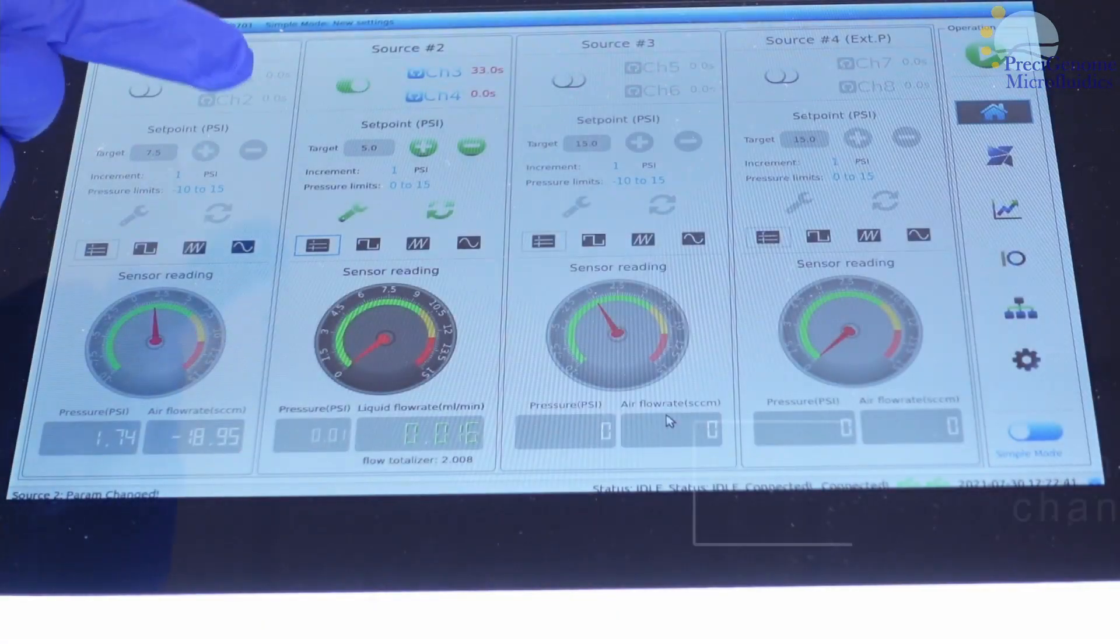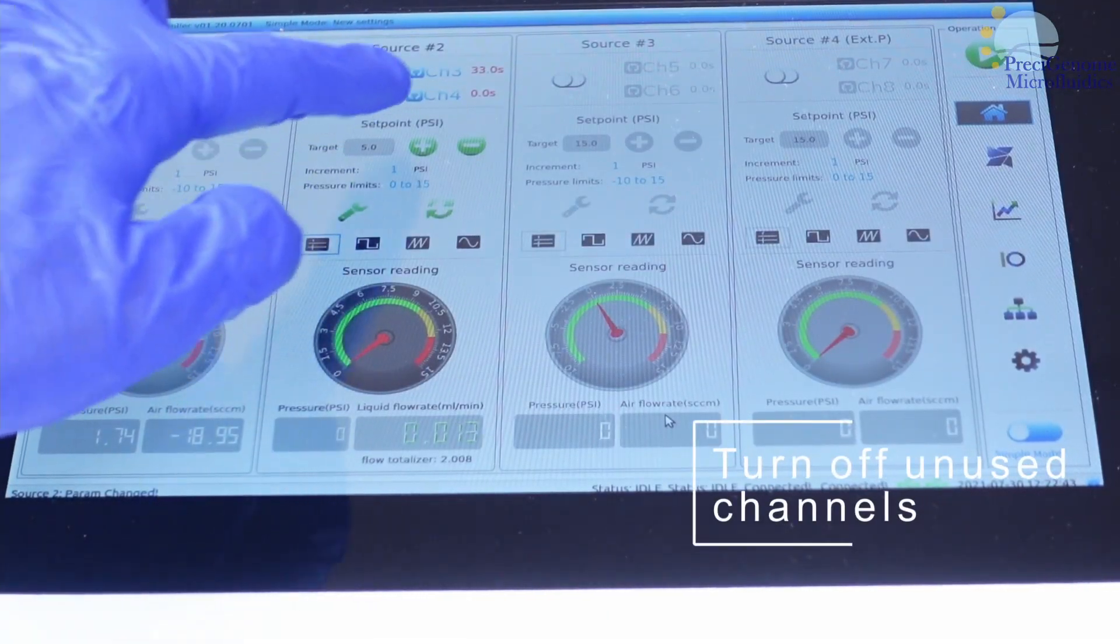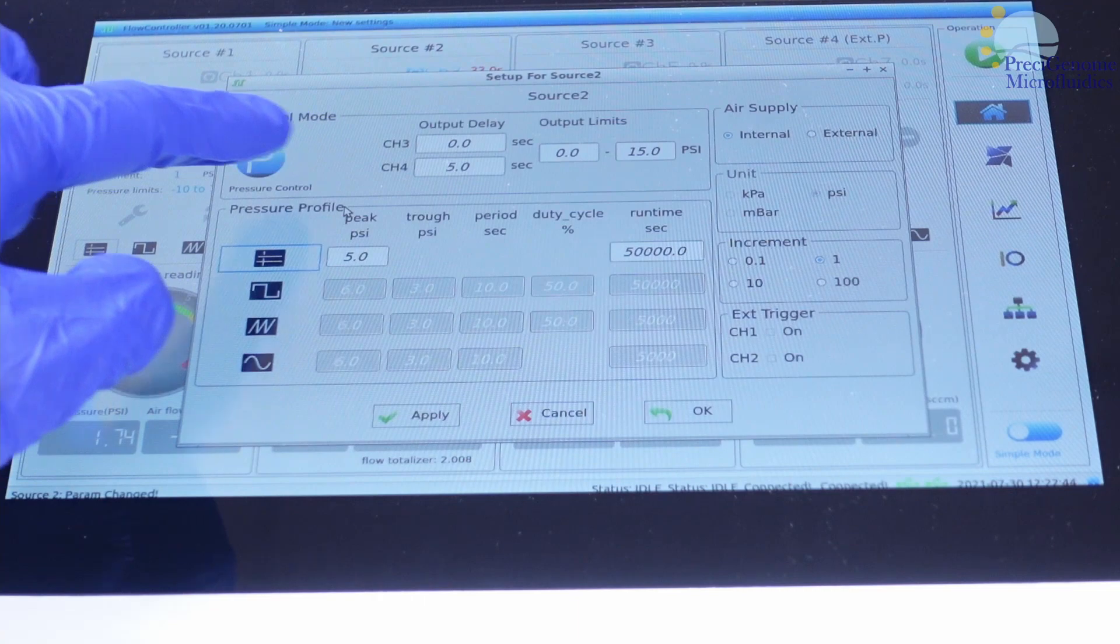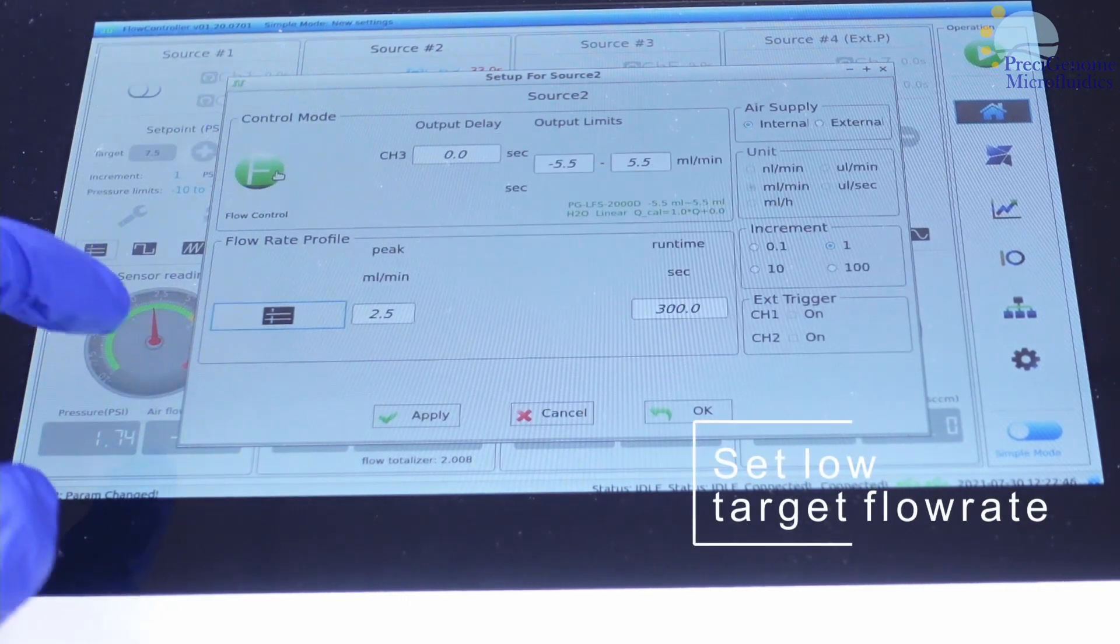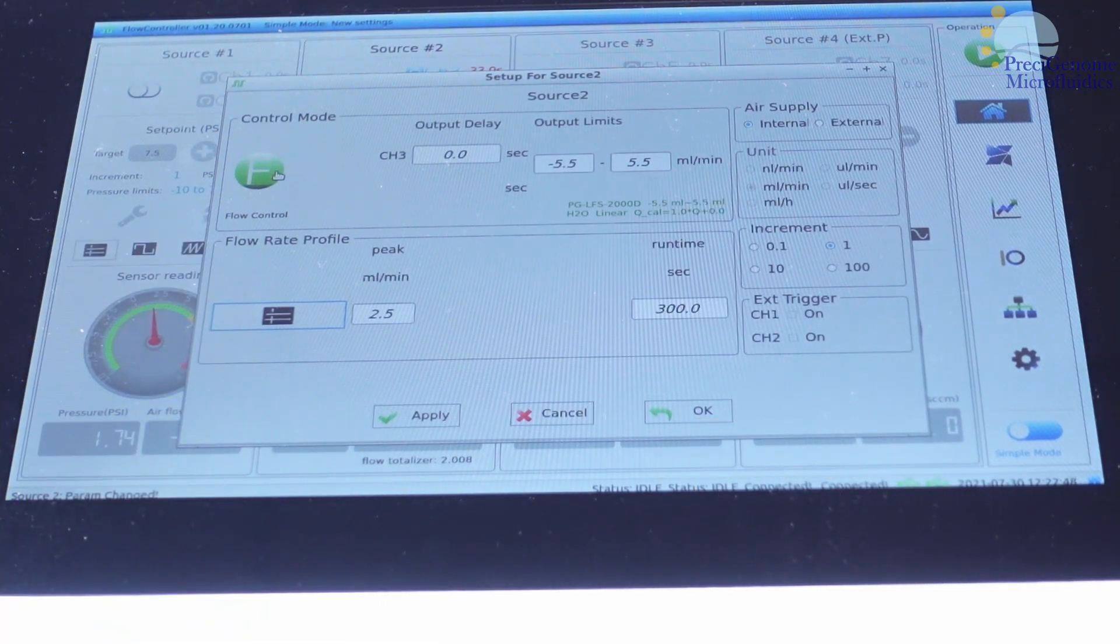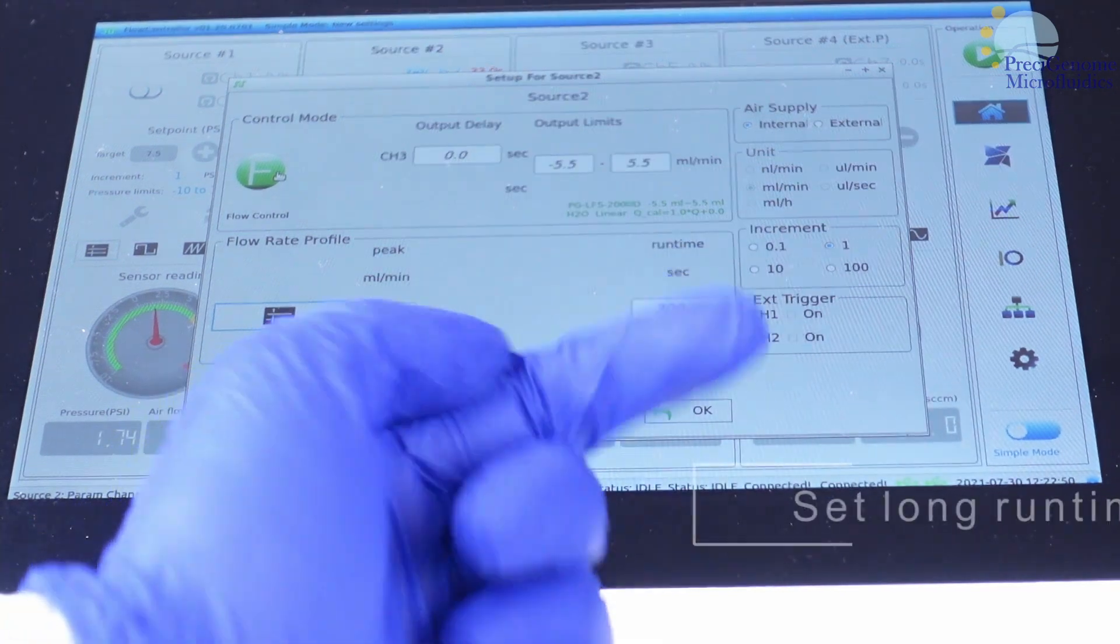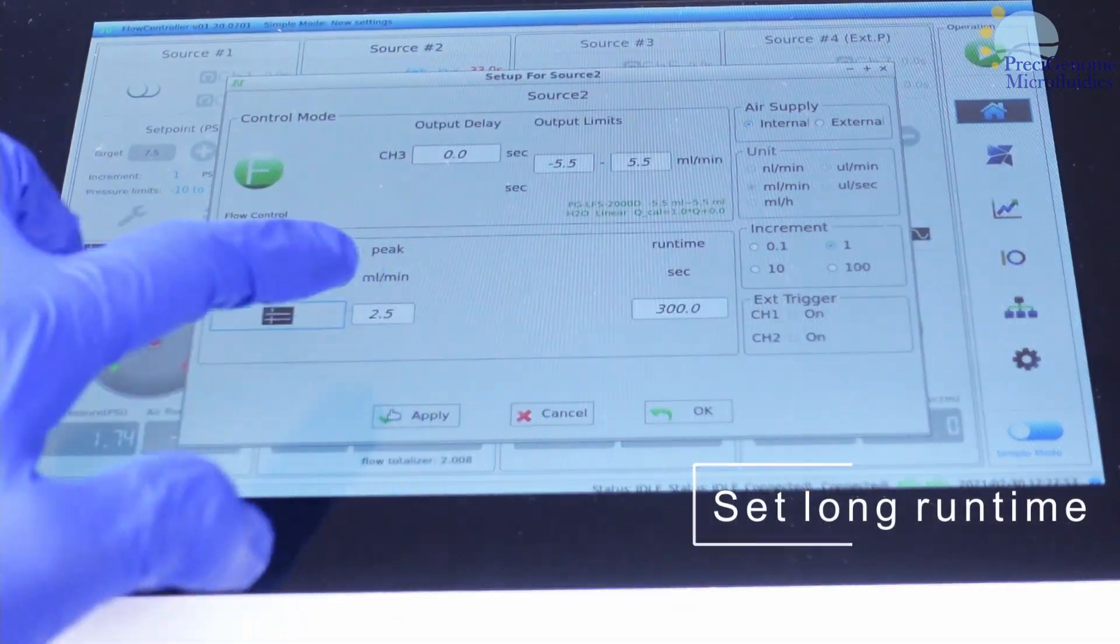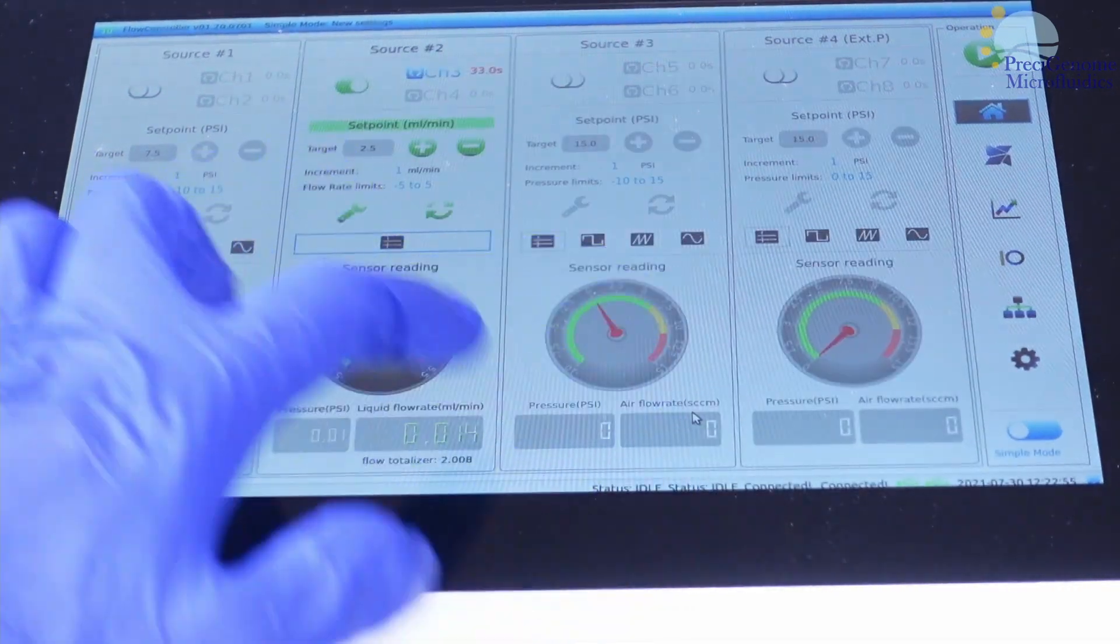Turn off any unused channels. Keep your target flow rates relatively low and your run times high. We don't want to end our assays early, and we want flow rates that are easy to reach.